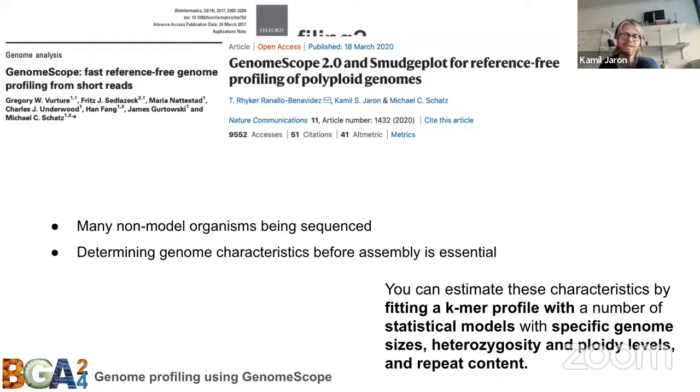And mostly it developed a complicated combinatoric model for ploidy level up to 6. So this is actually pretty neat, that it works for all the plant genomes, where you really need the most to have a nice model. While if you have a tiny diploid genome, you probably will be okay just assembling it, right? The more complicated the genome you're dealing with, the more important it is that you understand the data first. And those are very widely used tools. So it's basically a routine for most of the sequencing projects to simply QC, generate the histogram, and run Genomescope just to see how it looks.